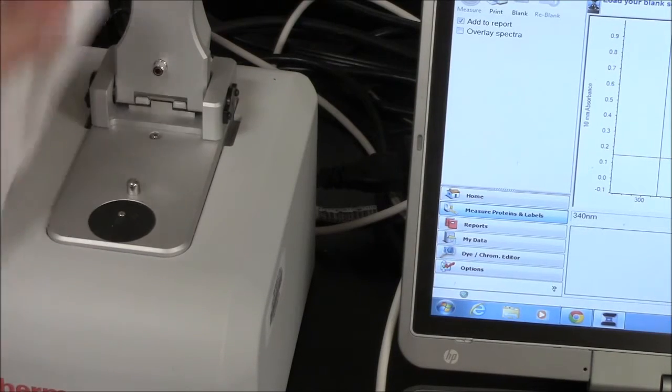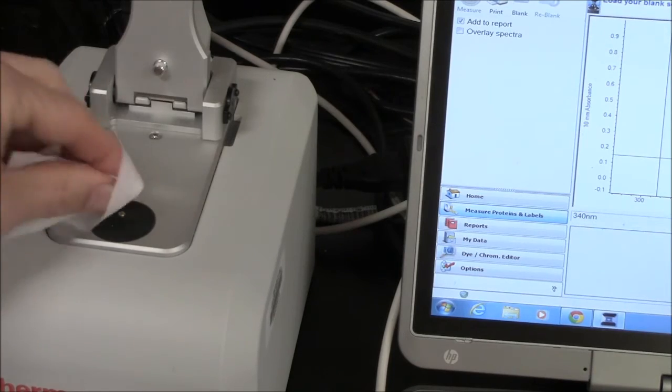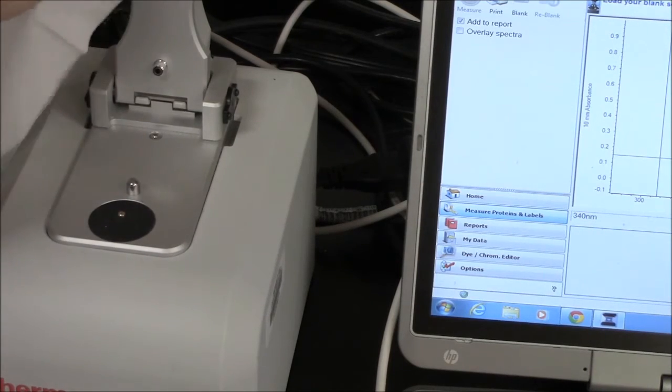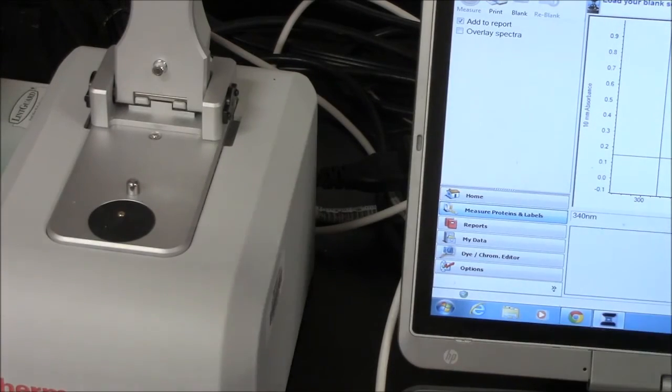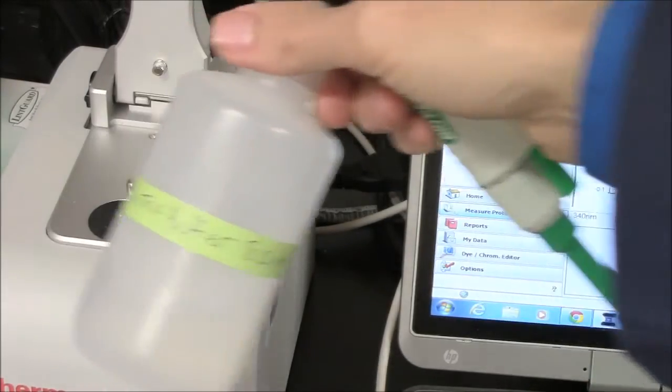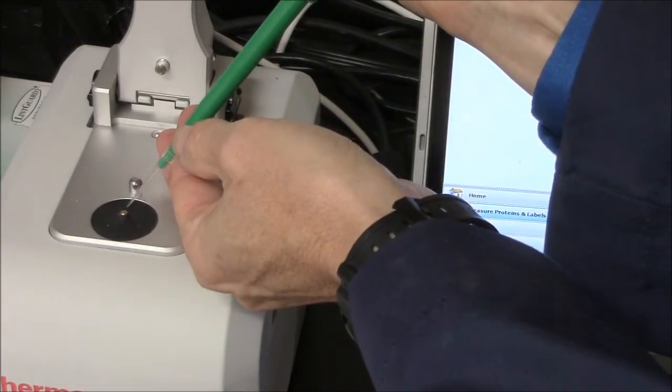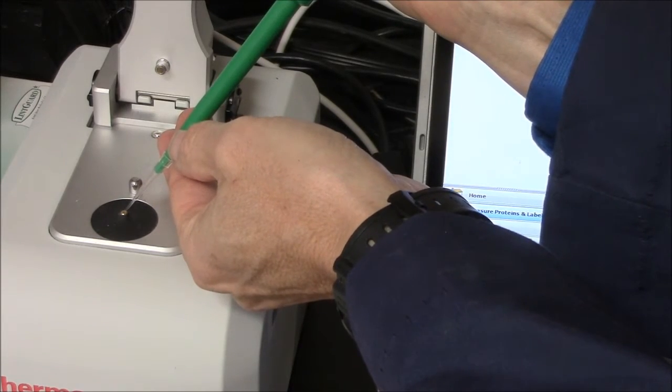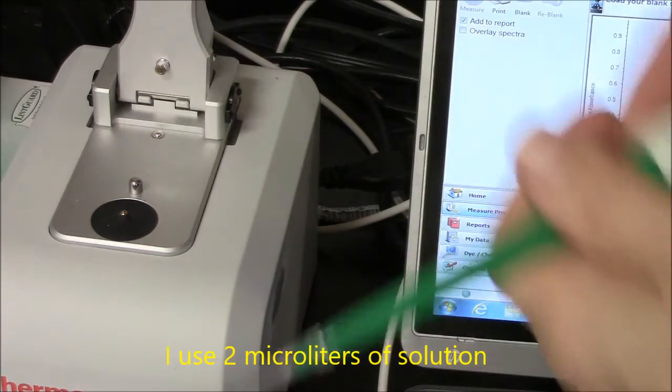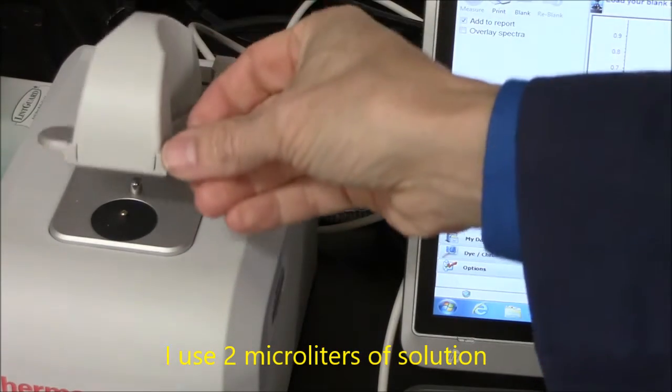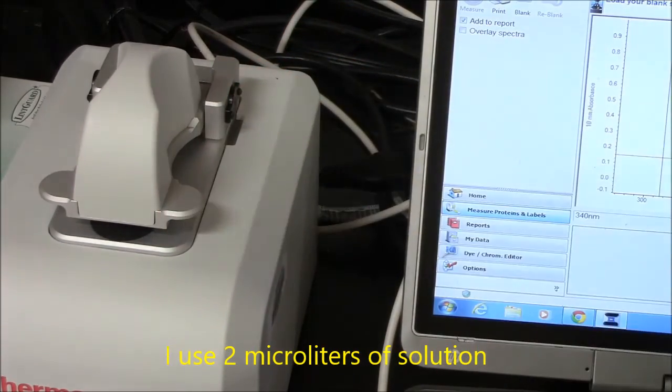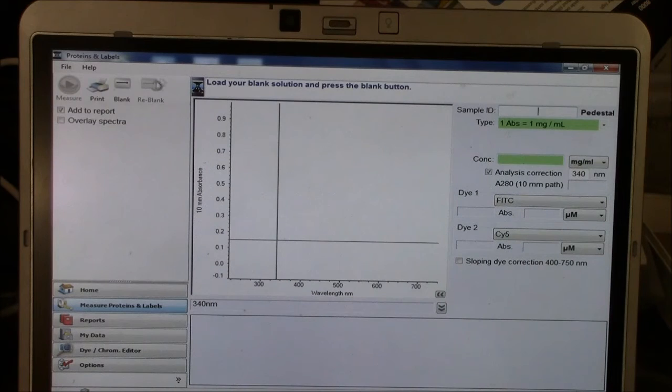I prepare the spectrophotometer by wiping off any residual solution. For the blank I'm using this buffer. I'm putting two microliters onto the pedestal. This will be my blank.